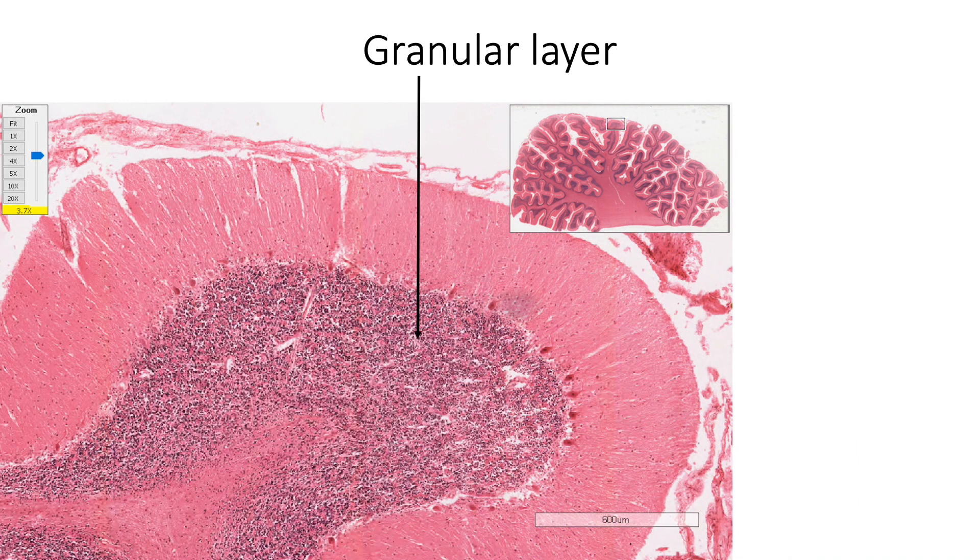Innermost layer of the cortex is the densely basophilic granular layer, named due to the numerous nuclei seen here. Although cerebellum forms only about one-tenth the weight of entire brain, it has more than 50 percent of cells in the brain due to densely packed granular cells, which are seen in this layer.